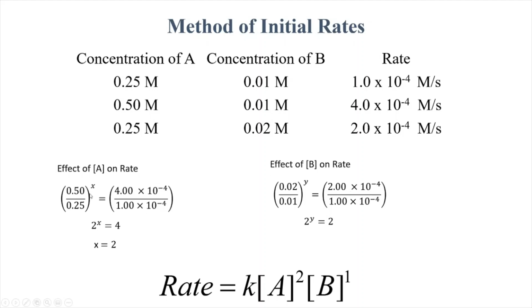The data normally would not be this neat. I'm just doing this as a demonstration. Normally these numbers wouldn't be as perfect, right? You would get rates that had some actual numbers. They wouldn't be 1, 2, and 4. You would get real numbers, as you're going to see as we do the experiment. But when you do the division, you should see that these things are doubled or quadrupled or round ratios like that.